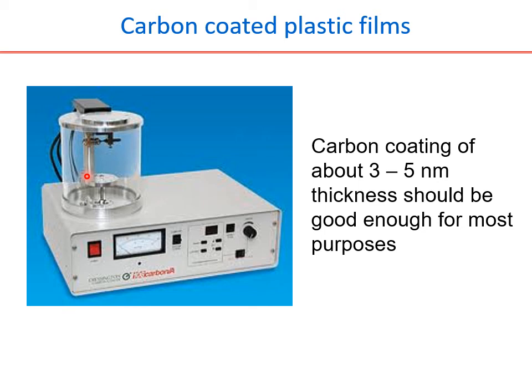Another precaution that has to be followed is that once glow discharge is done, this carbon grid, the copper grid with the carbon film that is glow discharged, acts like a magnet. So once a glow discharge is done, it has to be taken straight to the sample preparation. It should not be exposed to anywhere else. Even if, accidentally, it goes out of your hand and falls on any other surface other than the sample, it starts attracting them. So what you are going to see in the microscope is not your sample but everything else.